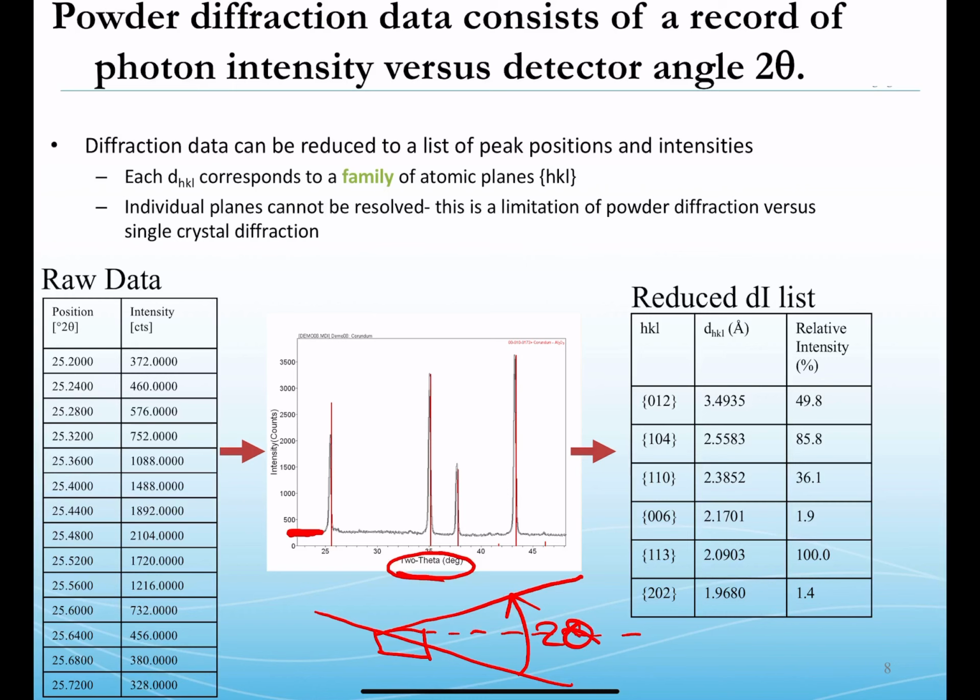And once Bragg's law is satisfied, then we'll build intensity at the detector, and then as Bragg's law is unsatisfied, we'll return to almost baseline intensity, very little, just background intensity at the detector. And then once Bragg's law is satisfied again, perhaps we'll get another peak of intensity in our X-ray diffractometer.